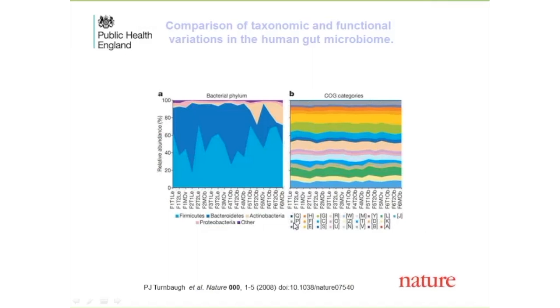You will notice on this slide that there is a consistent set of genes that are very stable, and all the samples can show that the gut microbiome may not constitute similar core genomes, but it is likely to have core physiological and metabolic genes that collectively create functions that make it quite effective.